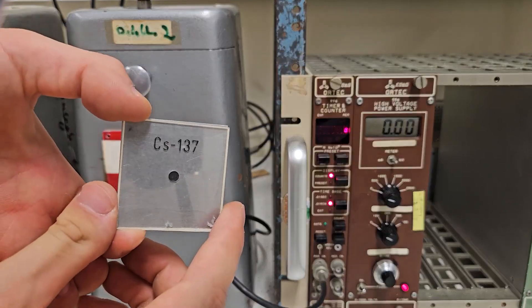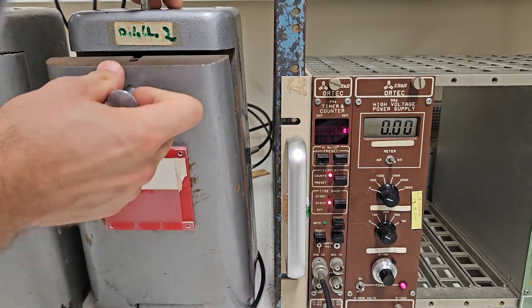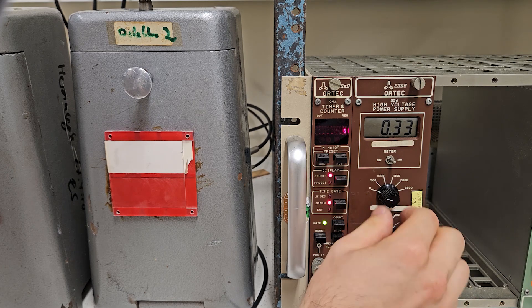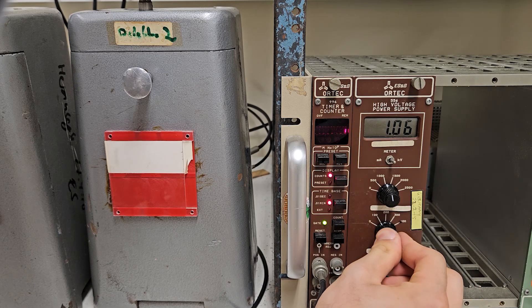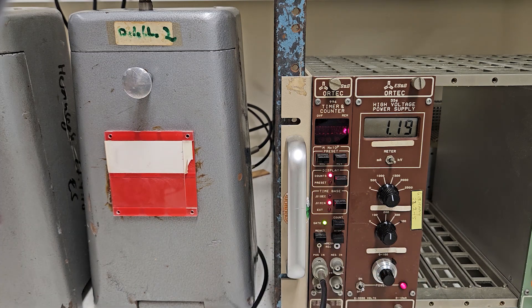After you insert the Cesium-137 sample in the second slot, you can quickly increase the voltage in steps of 100 volts until you see the first counts. That happened at 1,280 volts, but the display showed 1,240 volts. Now we only pay attention to what we set with the dials. The voltage is then increased in 20-volt steps and a data point is generated for each step.